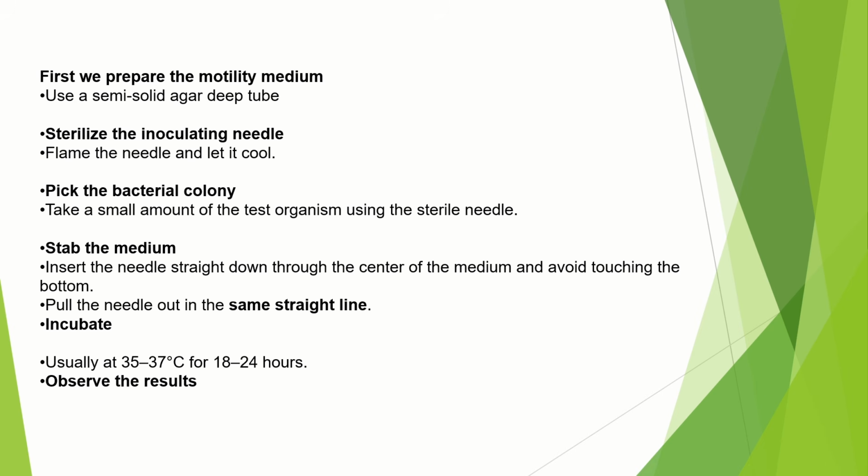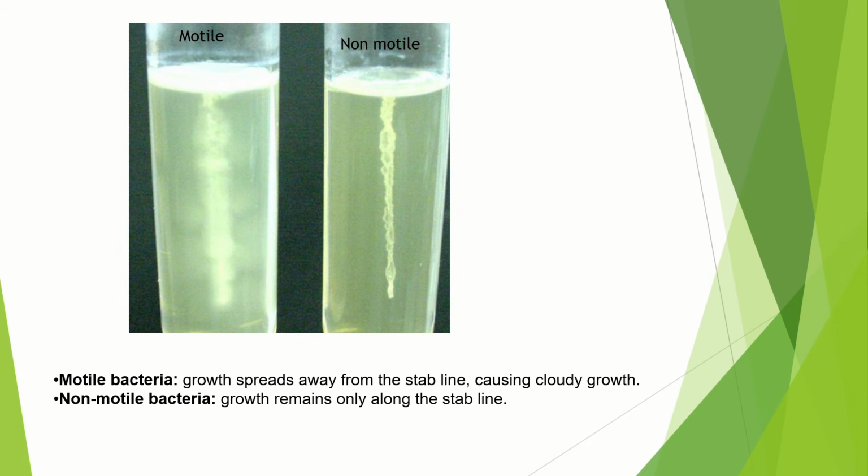Then comes incubation. We observe the result after the incubation. Motile bacteria will show growth that spreads away from the stab line, as shown in the left tube, while non-motile bacteria will show growth that remains only along the stab line, as shown in the right tube.